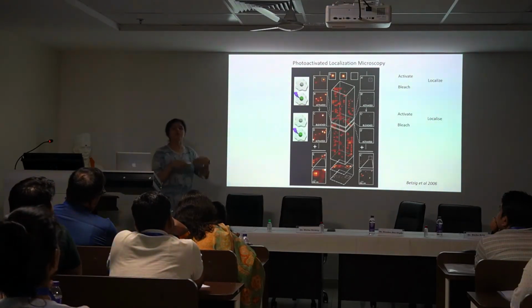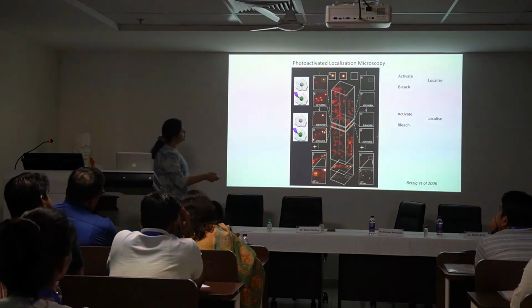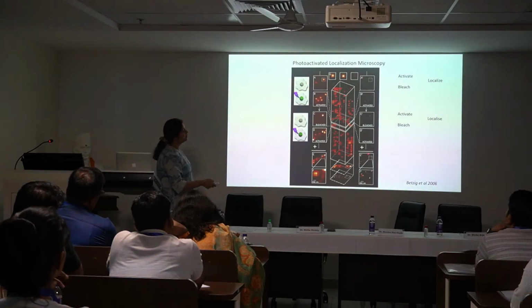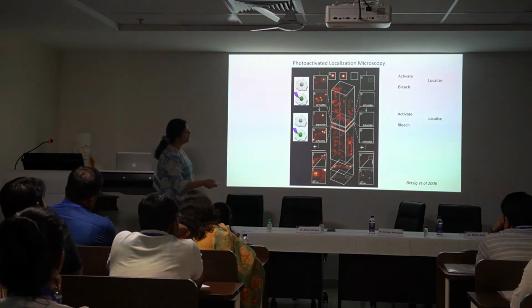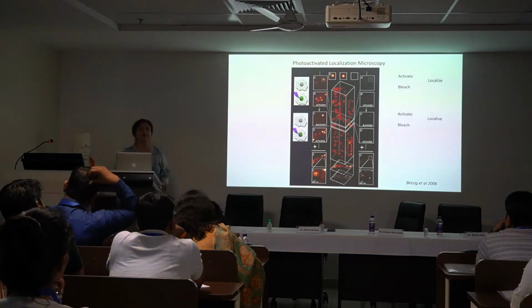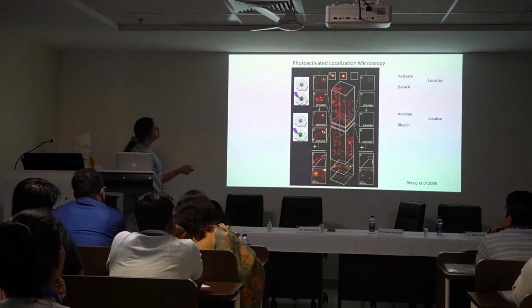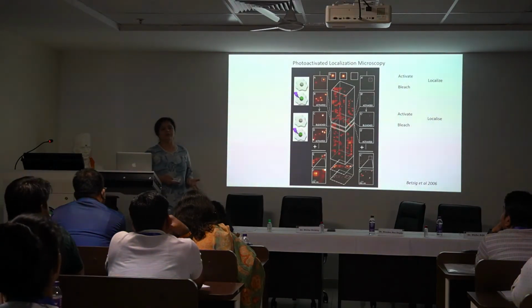And if you do this repeatedly again and again on a biological sample, then you can imagine that you can start seeing structures which are actually coming up in the sample, right? So in the beginning, you will just have one or two molecules. Then you will have more molecules, and you can do this iteratively again and again. Then you can actually look to see how that sample is, and how these individual molecules are placed. So this now is giving you unprecedented resolution in nanometers, okay?